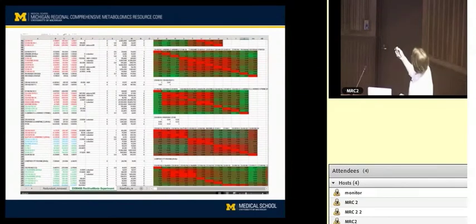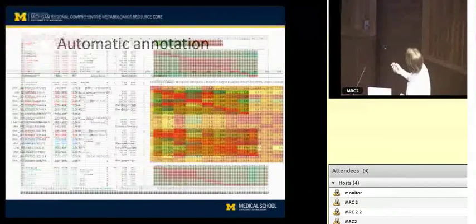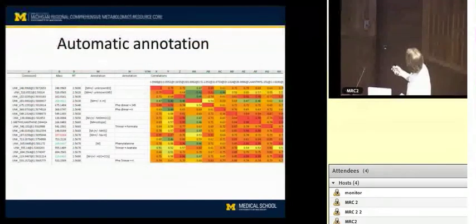So you'll start to see, maybe in this one, these are each distinct things, 1, 2, 3. There's one thing in this bin, 4, 5, 6. So we've just taken about 15 or 20 points of data and reduced it down to about 6 things. In some cases this is pretty extreme. For example, when phenylalanine comes out, because it's a really abundant feature, it can generate all of these different ions.